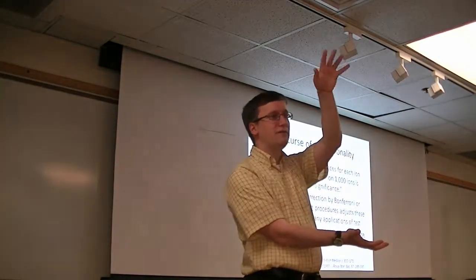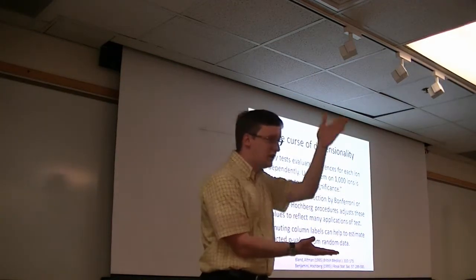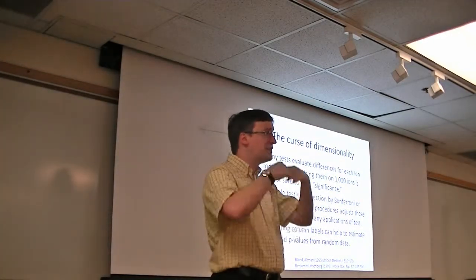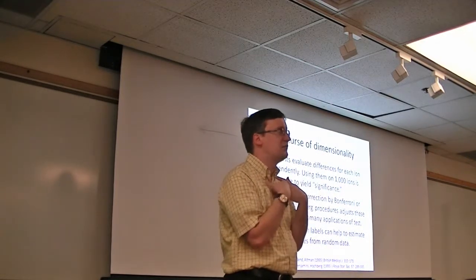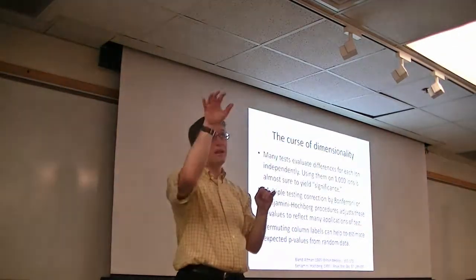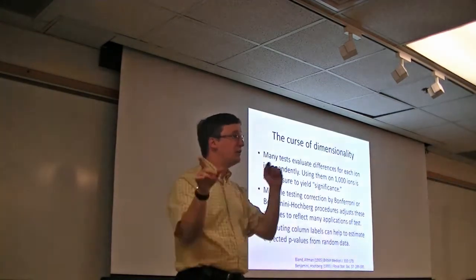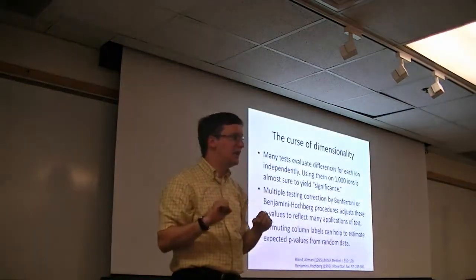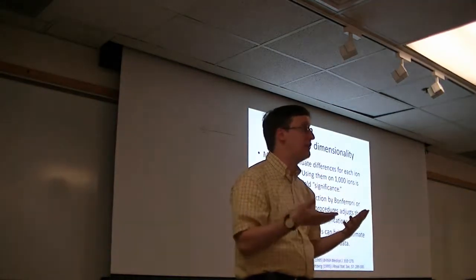Let's drop back to our 5 cohort A versus 5 cohort B, 20 metabolites. There's another approach that we can use to figure out what the random background model of what these p-values should look like. And that's simply to mix them up. Originally, we had these 5 being all cohort A, and these 5 were all cohort B. But we can scramble them up and relabel them to say these are now A, these are now B, and see what the p-value distributions look like when we've got them jumbled up like this.